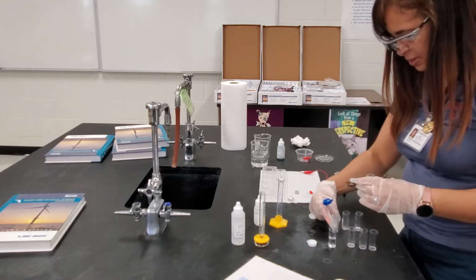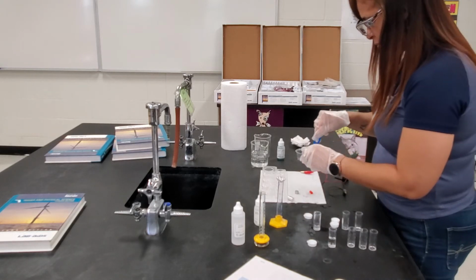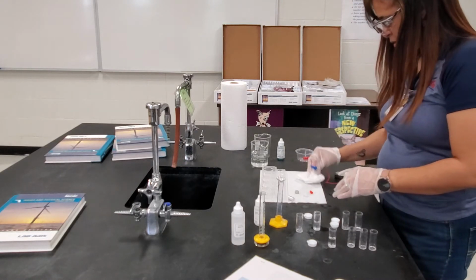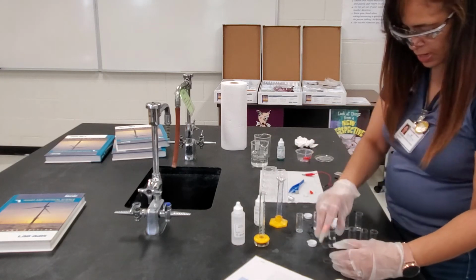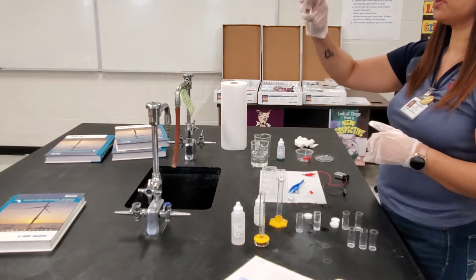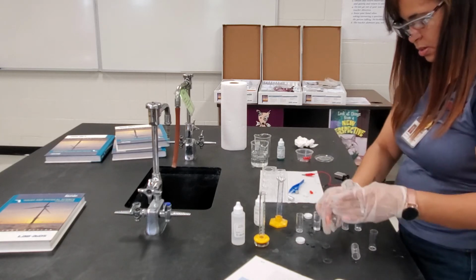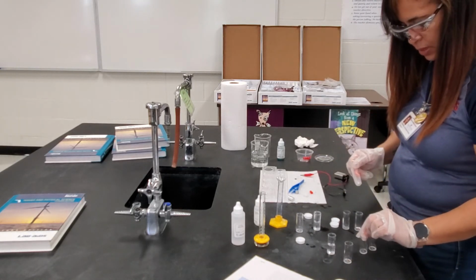Now, of course, getting the forceps in there is tough, so I'm going to pour the water out to make it easier to get that out. I don't really need it in a new vial, but just so that I can get access to it. And then the last test is the black piece in ethanol. And it sank right to the bottom. So the density relative to ethanol, the density of the black piece is greater. And I'll go ahead and pour the ethanol out so that I could get my sample out.